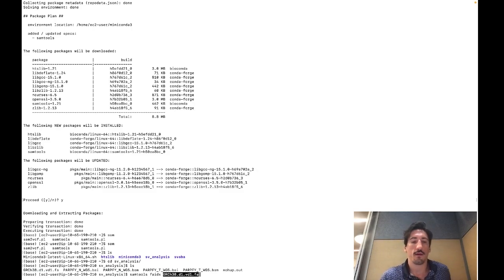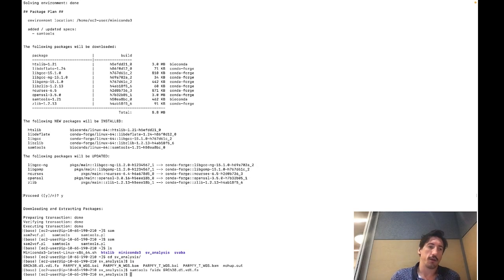And let it do its thing. This takes a little bit of time, but not as long as the BWA. BWA takes a while to run. And so I'm about to run that.